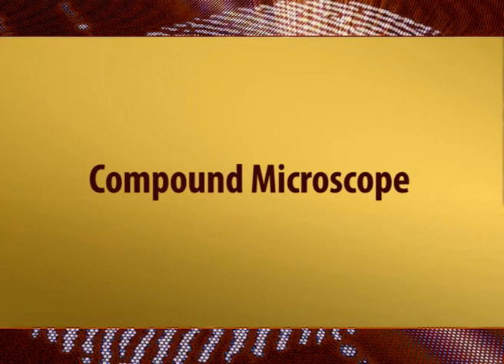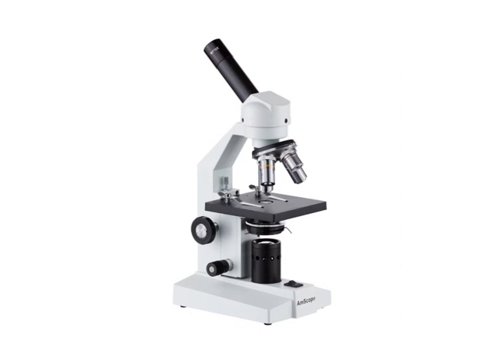Then we have the compound microscope. The compound microscope employs multiple lenses so as to collect light from the specimen, and then this light is focused into the eye with a separate set of lenses.